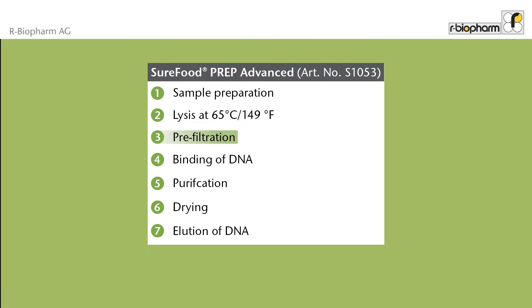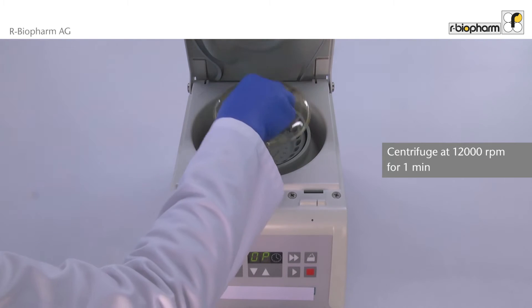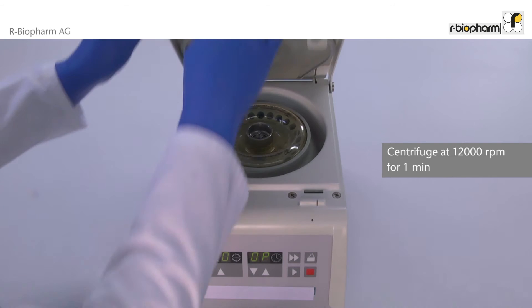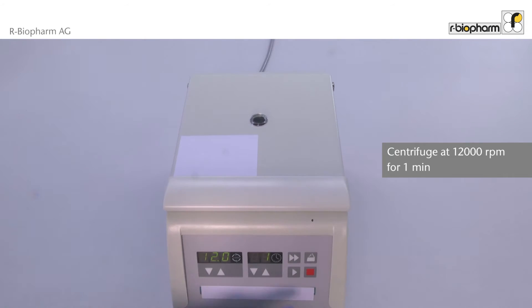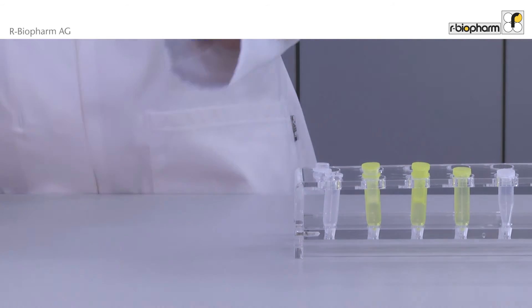In the next step, the supernatant is separated from the solid particles. After the incubation, centrifuge the sample at 12,000 revolutions per minute for one minute. Next, transfer the supernatant into a new reaction tube.